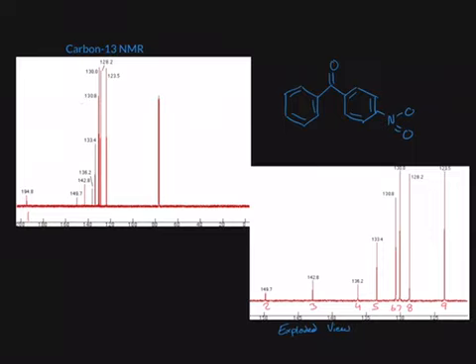The farther left on the chart, the closer the carbon is to an electronegative atom, just like in proton NMR. So for number 1, it will be the closest to an electronegative atom, which would be this guy right here. Number 1, it's double bonded to the most electronegative atom in the molecule. So the next would be 2 right here, because it's closer to the nitro group and the double bond oxygen, and then 3. So from here we're going to actually move down towards the nitrogen, because that is our next most electronegative atom, and it's as close as it possibly can get.